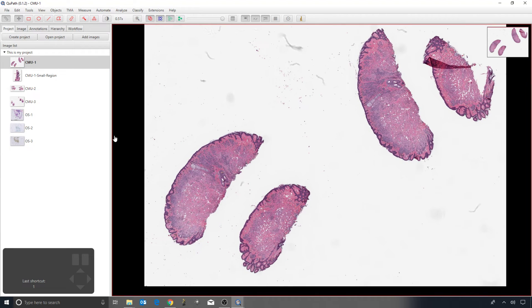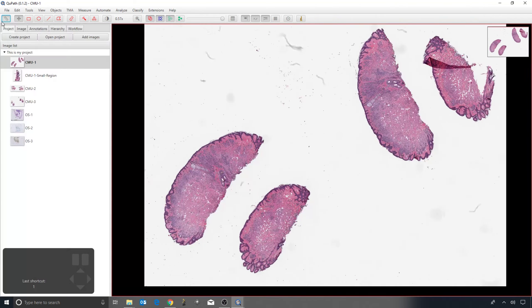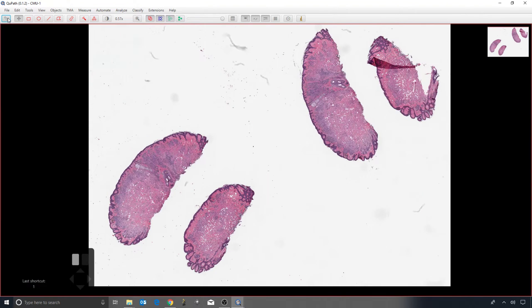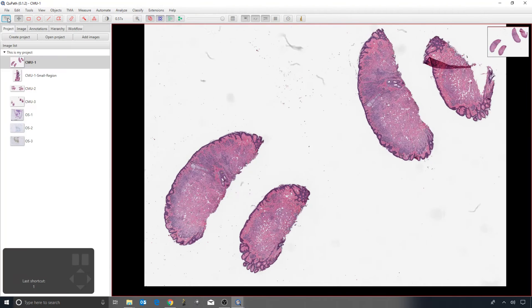The first tool in the top left looks like a little ruler. If I leave my mouse over it, it tells me what it does, which in this case is 'Show Analysis Panel' — which is really just this window over on the left. Normally I would leave it turned on.